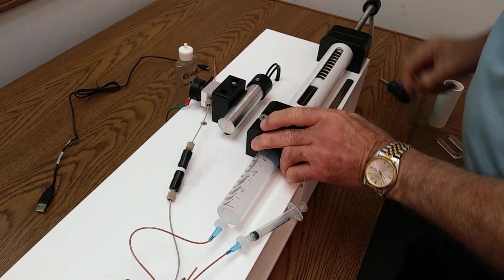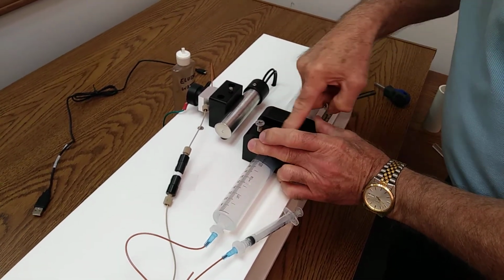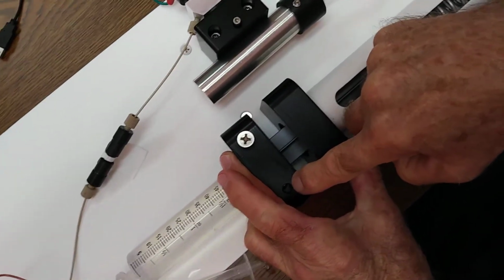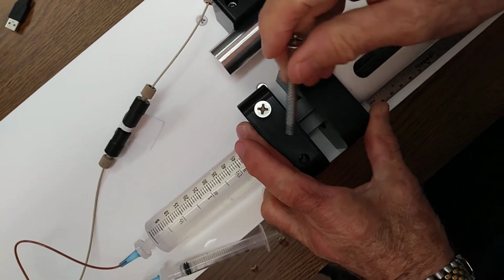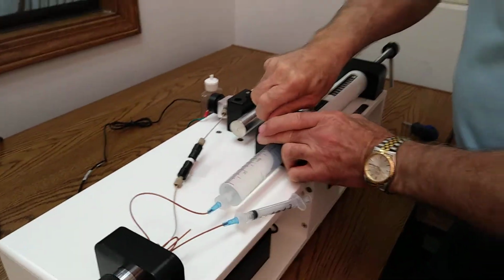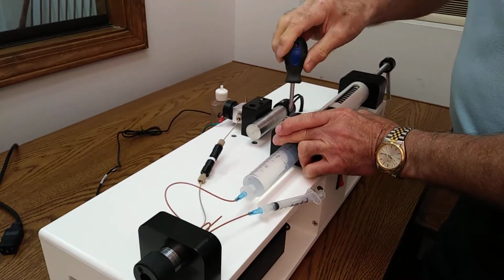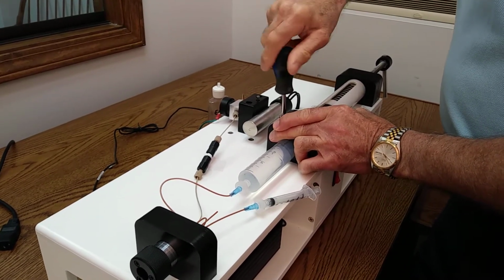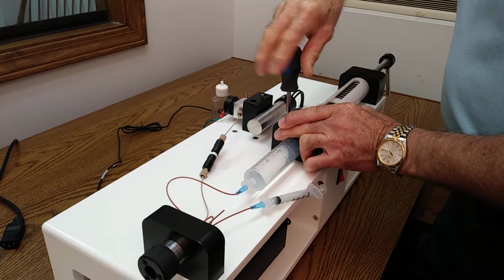Put this one in place. I'm holding it, I'm looking down through the hole to see all the way through. When you see light coming up from the bottom, you're there. So you push that one in, and gently hold this back, hold a little pressure on it while you tighten these down to finger snug.